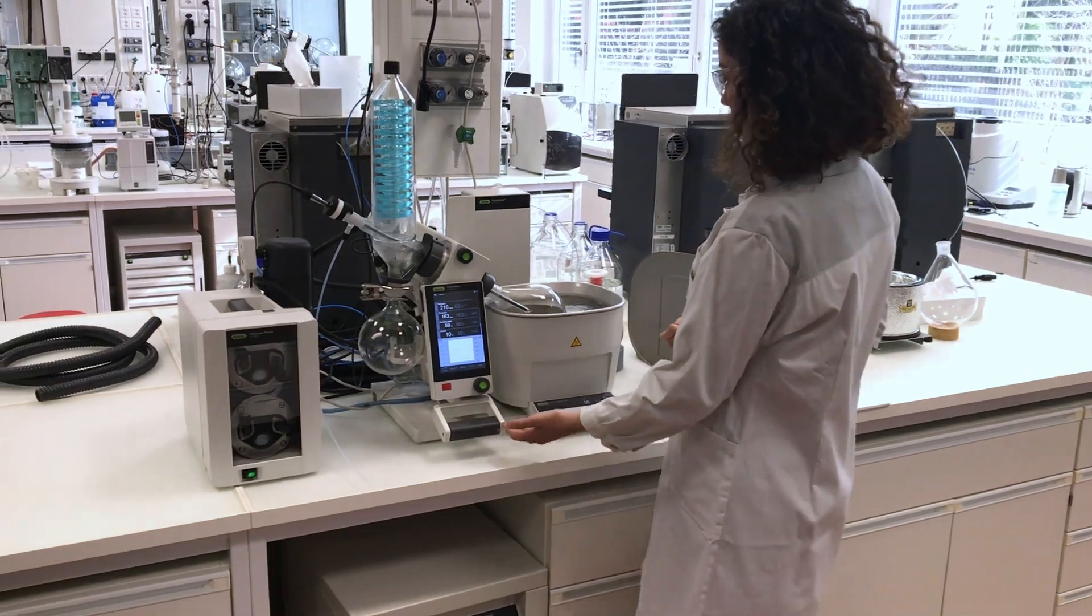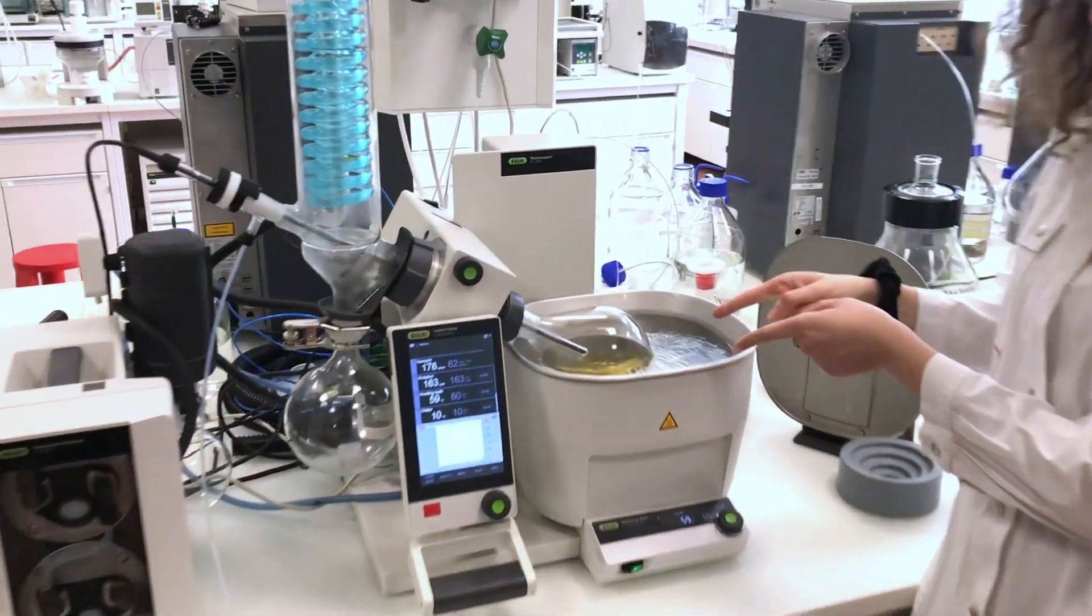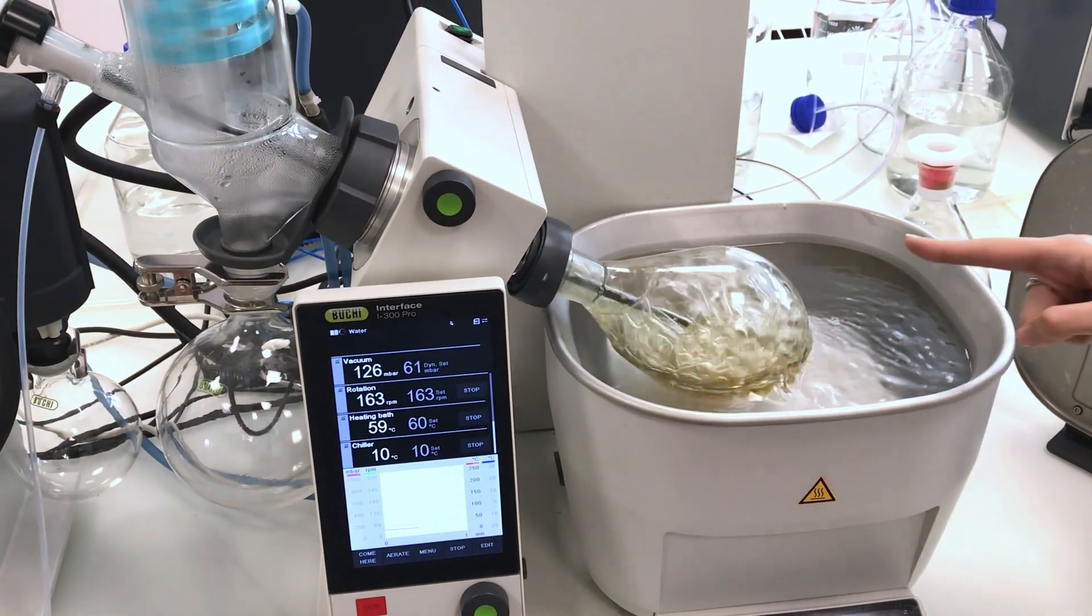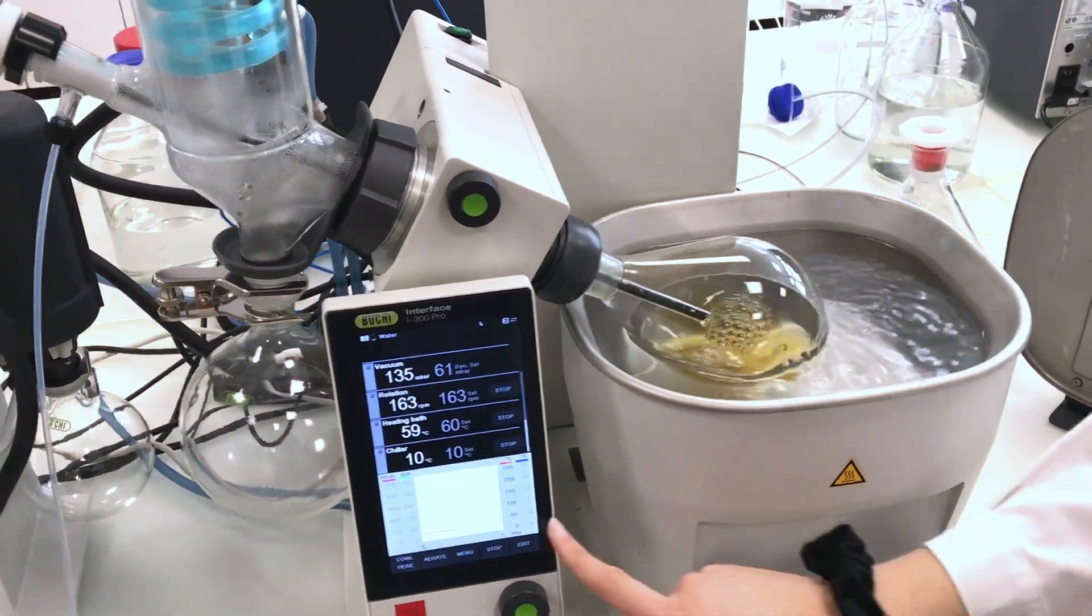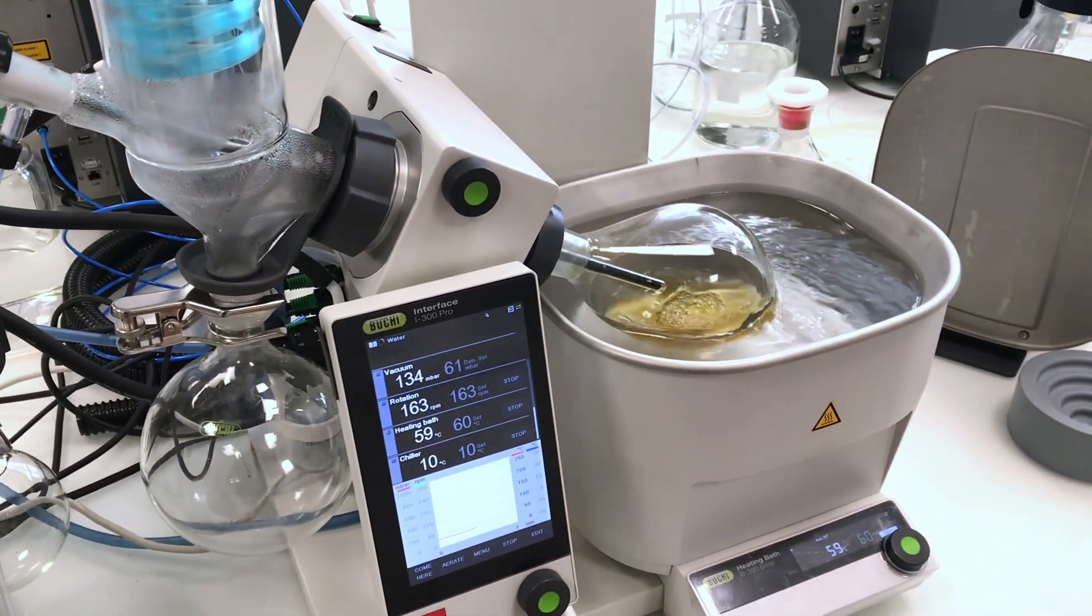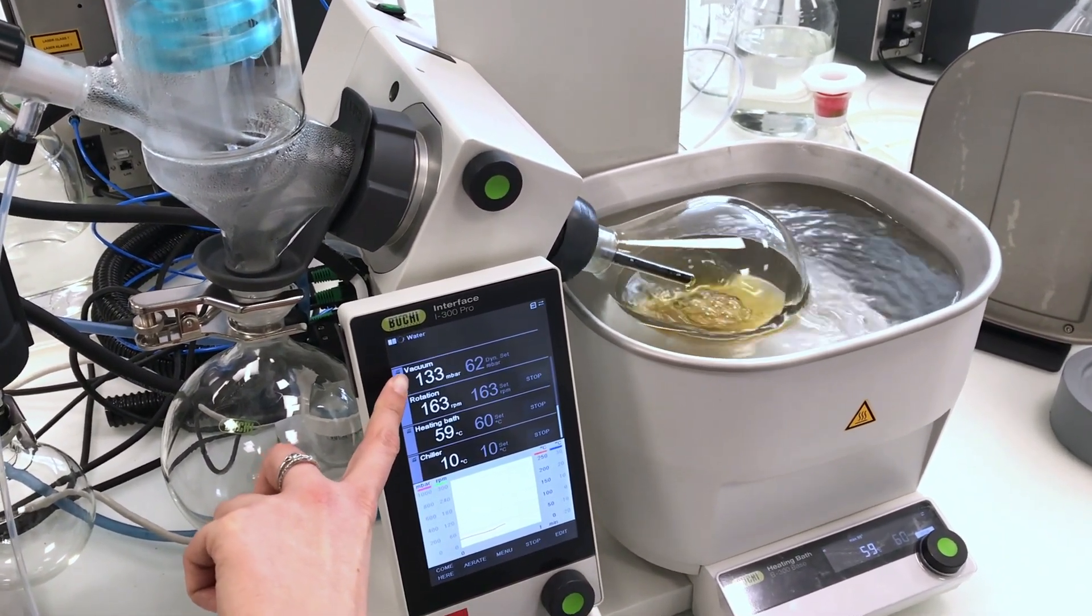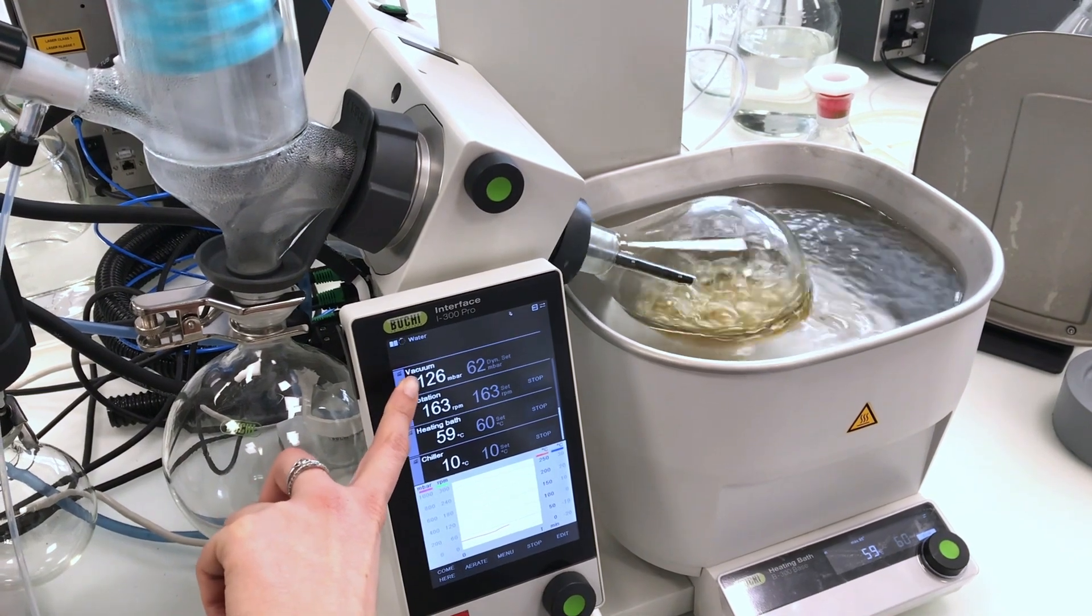Now let's get closer because something cool is going to happen. There you go! Foam is appearing and foam is disappearing. So what happened here? The foam sensor, this black thing here, detects foam coming in, breaks the vacuum, and then the foam breaks as well.